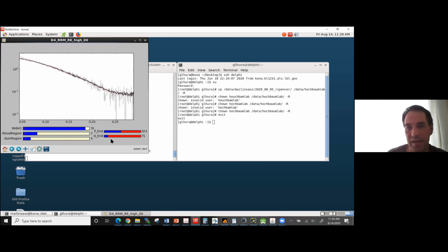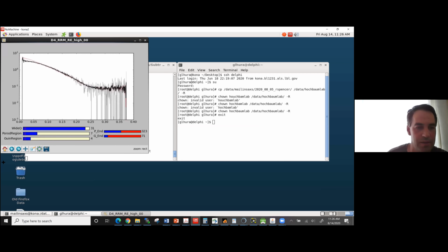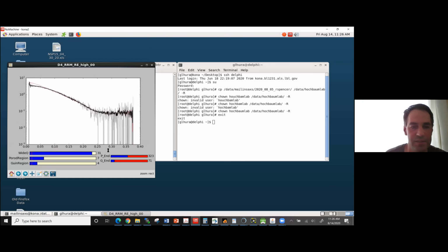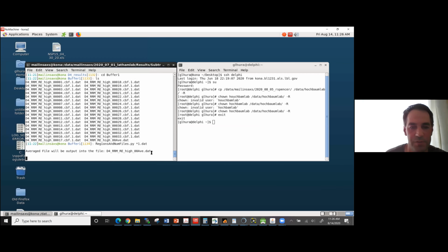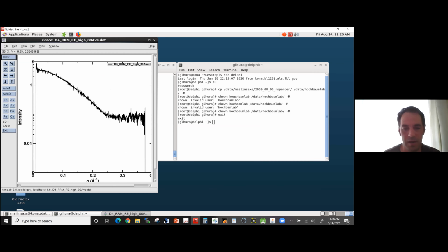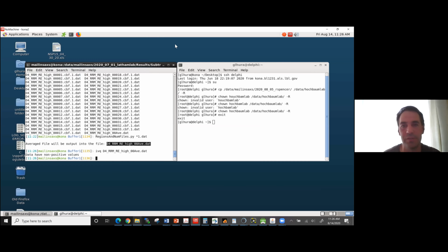All right, so now I've got a final curve that I'm happy with, and I can hit home here. And in this particular version of this frame slicing, the frame is saved as defined, as an output here. So I've got a curve that looks like that, and I can plot it on its own. That's the curve.